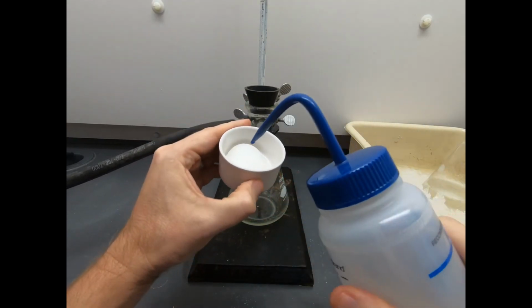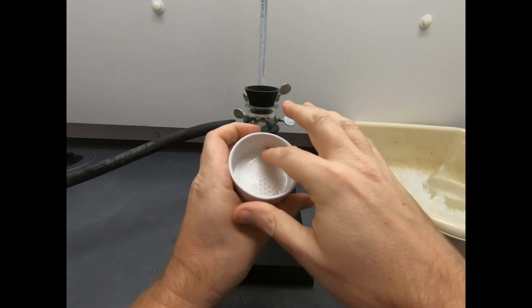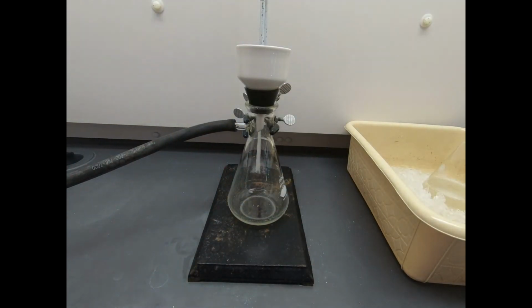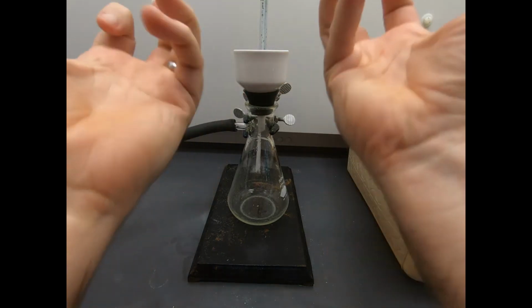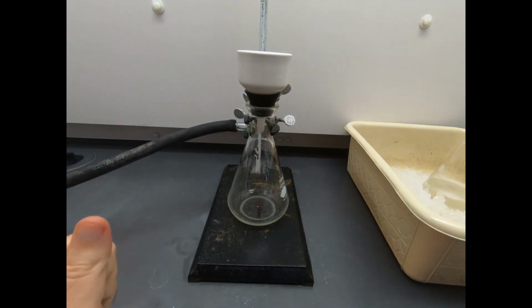So let's go ahead and squirt a little water in here and make sure that we're covering our holes, and we are. That looks good. Now, before you do a filtration, you want to turn on your suction and get that filter paper nice and sucked in to the filter plate of your funnel. And now we're going to filter our solution.